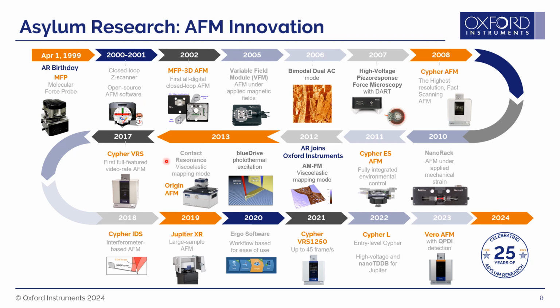Early on, Asylum led the AFM industry in developing closed-loop flexure scanners that greatly improved AFM scan accuracy and repeatability. Even today, many common AFMs use old piezo tube scanners and outdated sensor technologies that limit their performance.